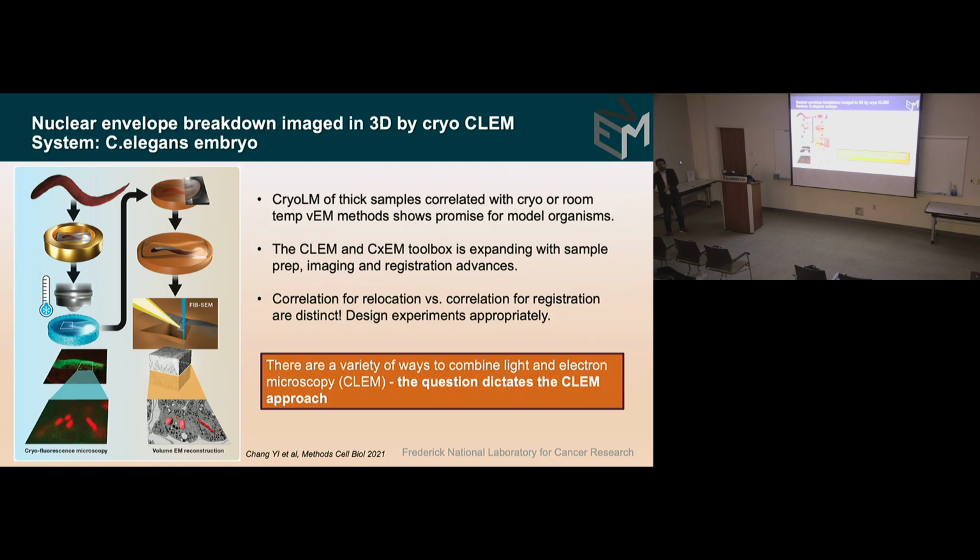And once we did that imaging completely separately, you did the TEM imaging, I think. So along the cells, the 3D volume image didn't translate exactly to the TEM. It happened to be in another location. You could grab it. Correct. And do TEM on it.